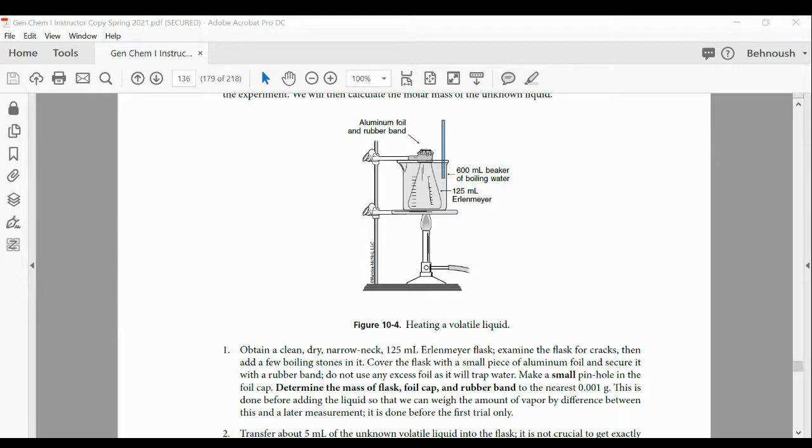Or another way to say it, if you leave the flask for a long time, like maybe at least like 3 to 5 minutes inside the hot water, and you give enough time, the temperature inside the flask and outside of the flask is going to exchange, and it reaches equilibrium, and at the end it would reach the same number.